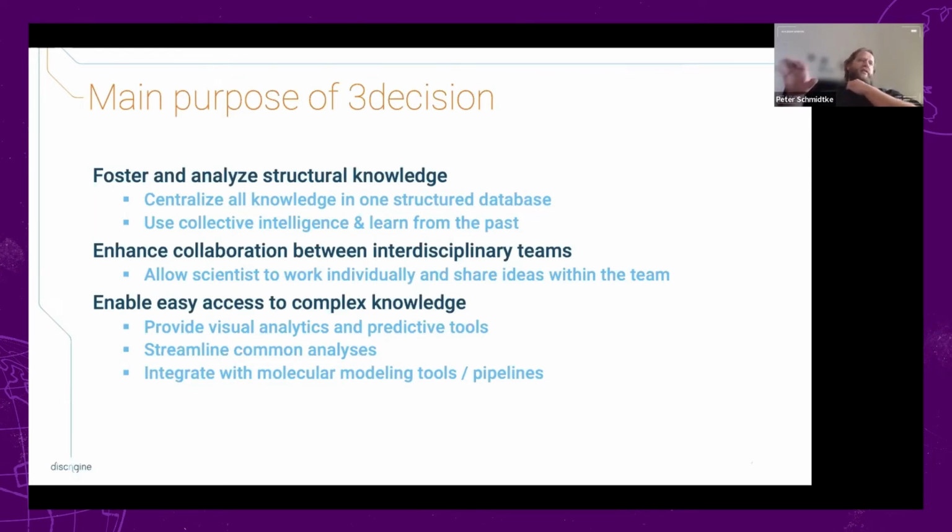And by feeding in new information, so new experimental structures being resolved or new models being created, the system actually automatically has more information content, so it learns without using the AI buzzword. It learns basically from what you put in there for new projects.